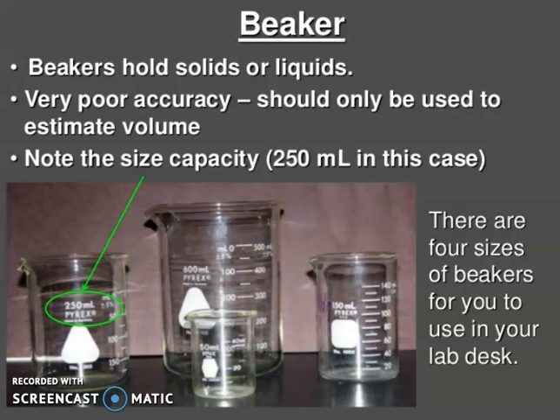Very poor accuracy, it should only be used to estimate volume. You can see written here 250 milliliter, but it is not very accurate. Note the size capacity, 250 milliliter in this case, and there are 4 sizes of beakers for you to use in your lab desk.